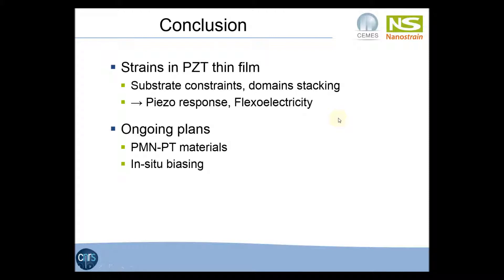We have shown that we can evidence strains and rotations induced by the substrate and stacking of the domains in a PZT film using transmission electron microscopy. This is important to understand the piezoelectric and flexoelectric properties of these materials. We are also working on PMNPT materials and trying to apply a bias to these samples inside the microscopes in order to directly observe piezoelectric mechanisms.